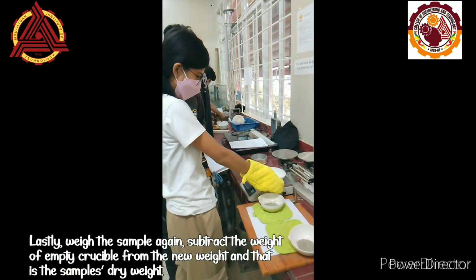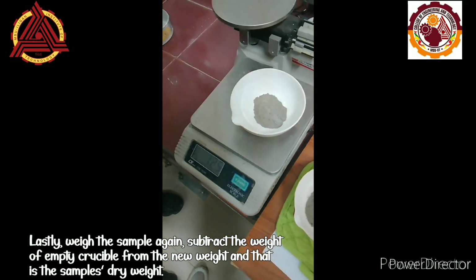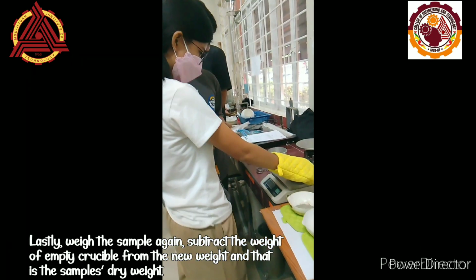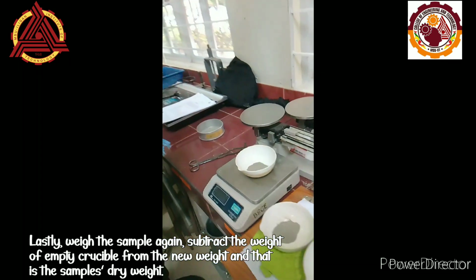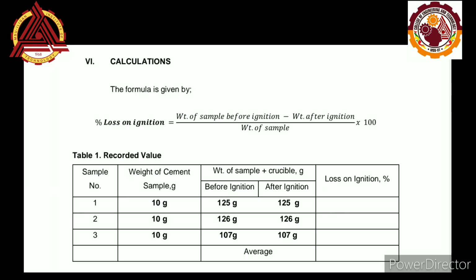Lastly, we have to weigh the crucible with the sample again. Subtract the empty crucible weight from this new weight, and that is the sample's dry weight. The formula is given by percent loss on ignition is equal to the weight of the sample before ignition minus the weight after ignition divided by the weight of the sample times 100.